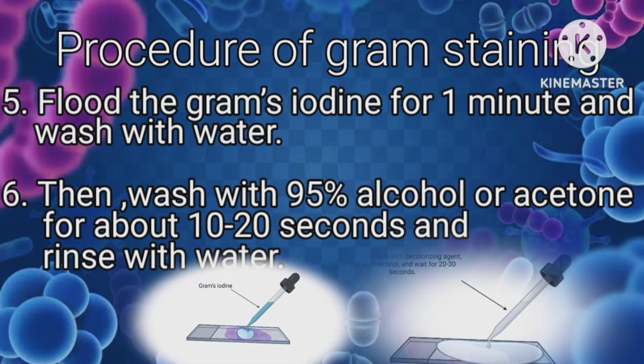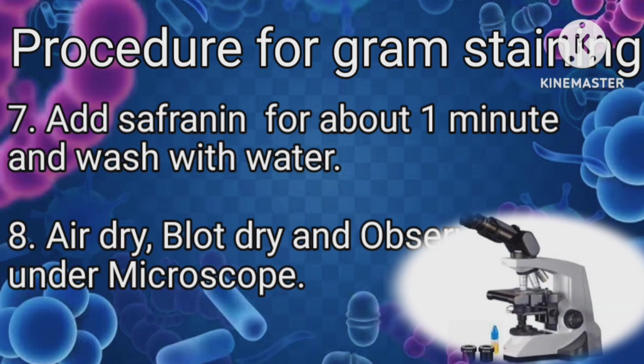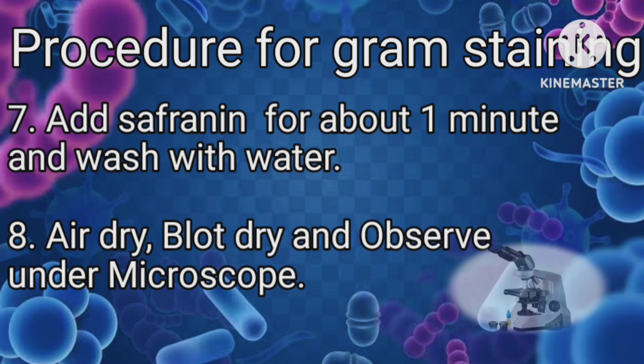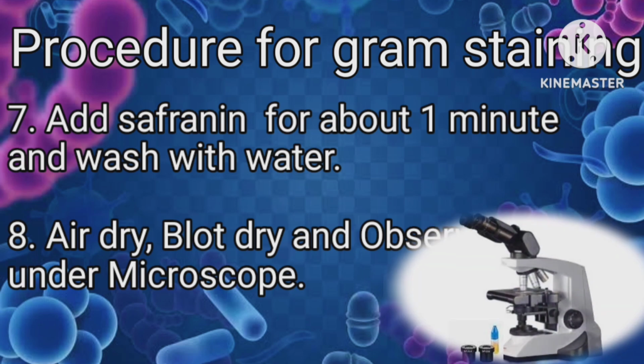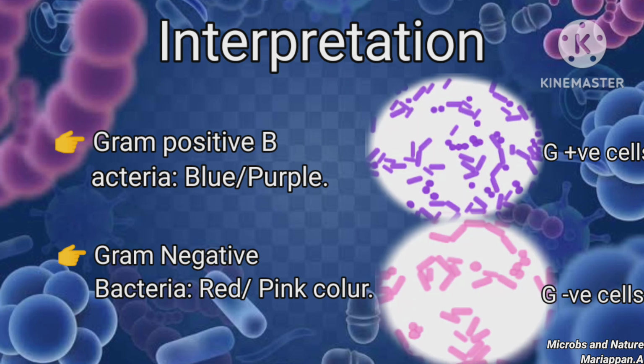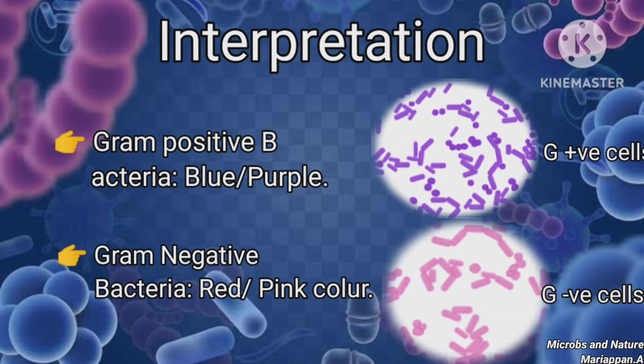Seventh step, add safranin for about 1 minute and wash with water. Eighth, air dry, blot dry and observe under the microscope. Interpretation. Gram positive, blue or purple color. Gram negative, red or pink color.